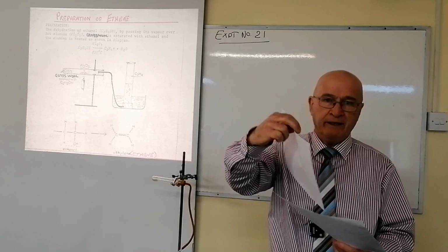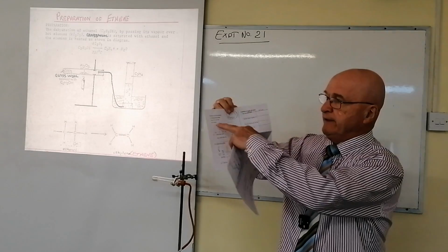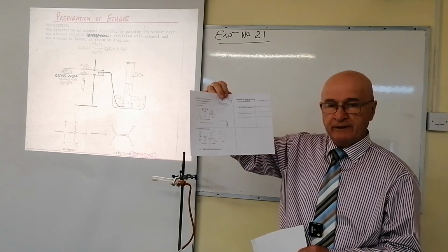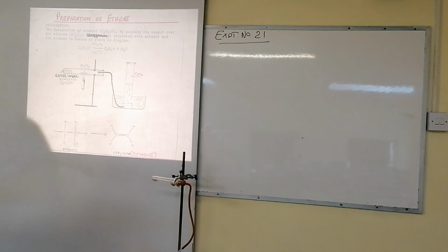Now, you should all have that page in front of you right now. And I have outlined the apparatus for it there. You'll be filling in the blanks of A, B and C as we go through that, okay? So if you haven't, please pause the video, go away and get it, please. You need that immediately for your work, and go and get that now, please, and you'll be fine.